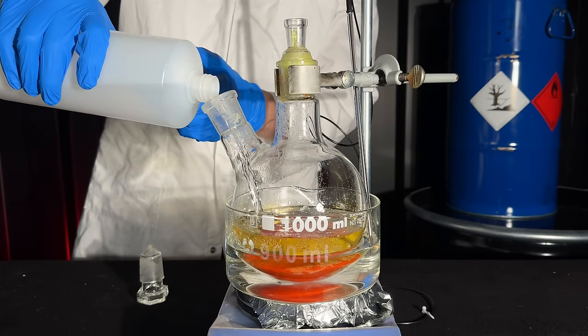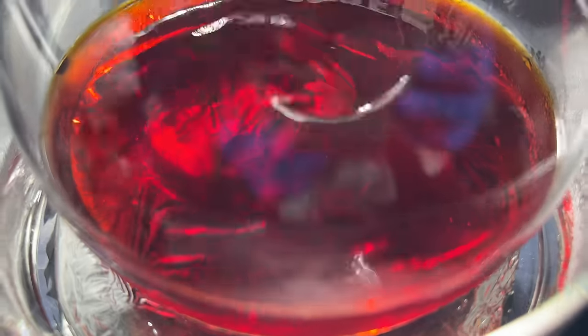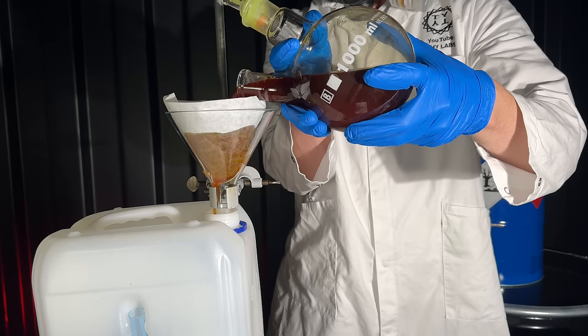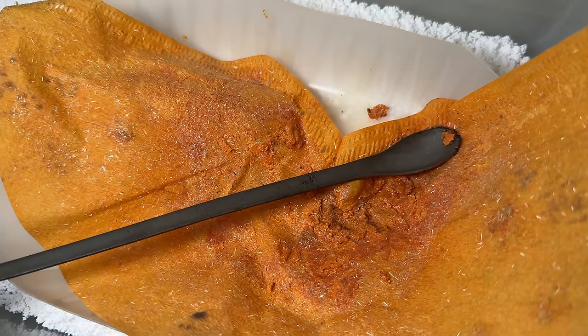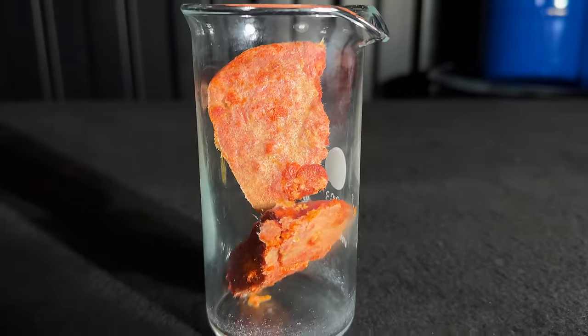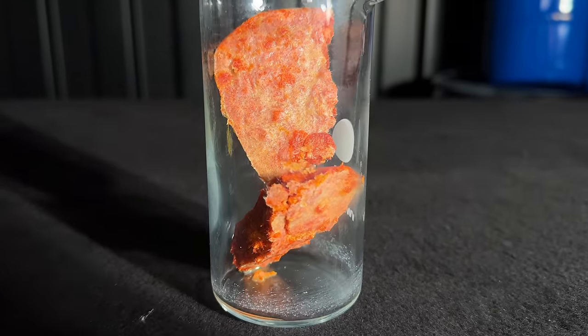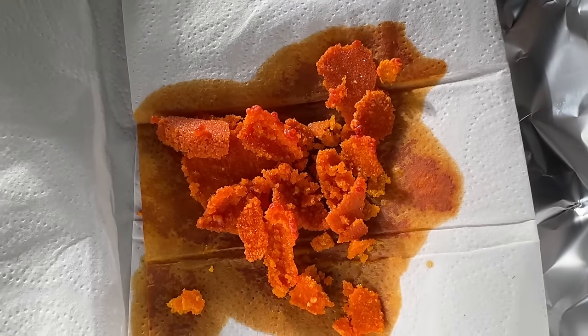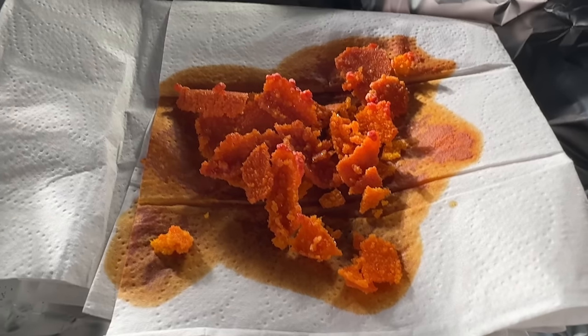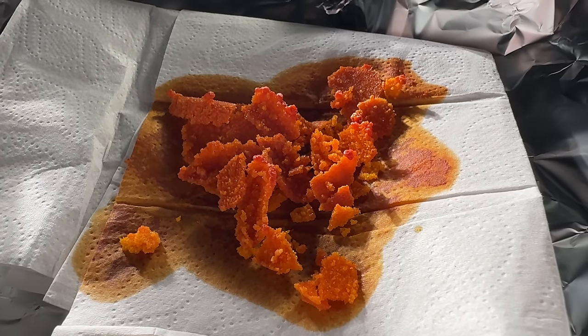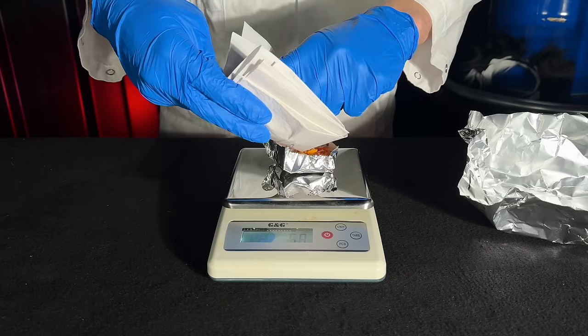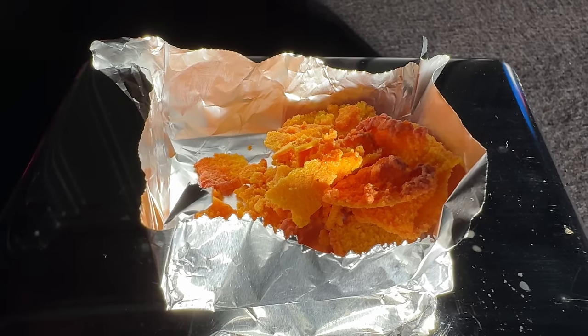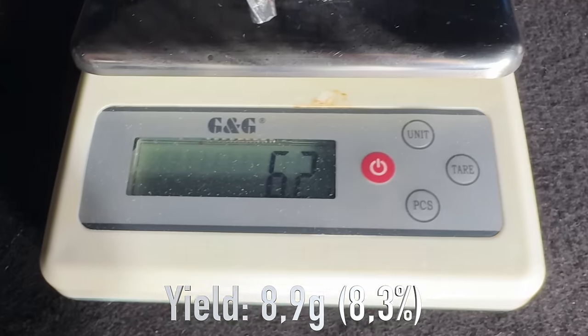From this recrystallization I got 2g of not so clean looking product. I combined the waste with water to crash out the rest of the product and got 40g of this trichlorophenol. This was recrystallized from acetone and I ended up with 6.2g of clean looking product. In total I got 8.9g of product and this represents a yield of 8.3%.